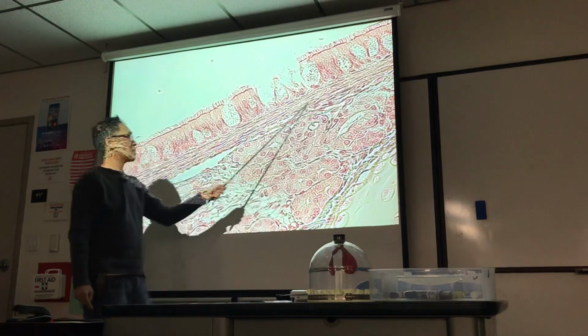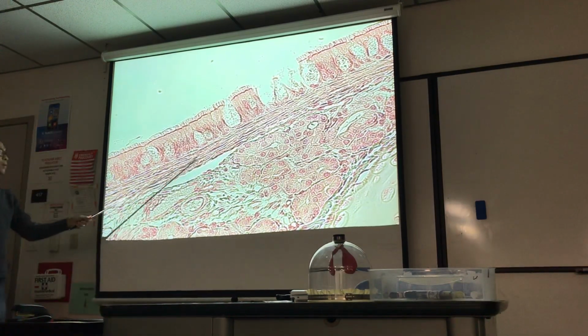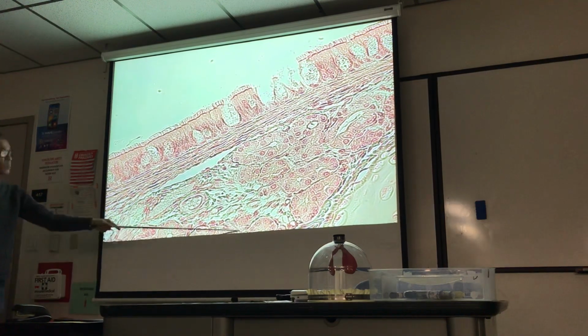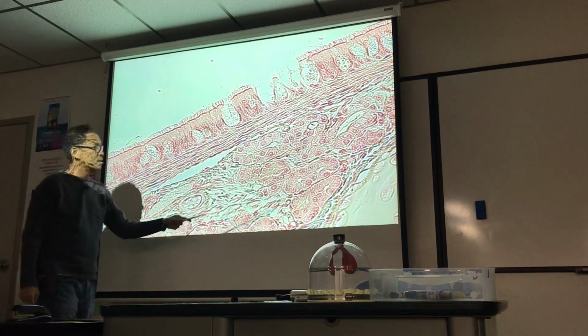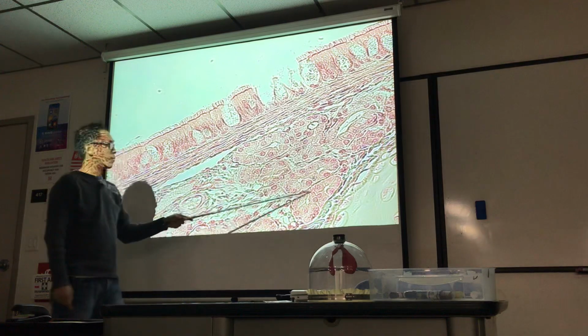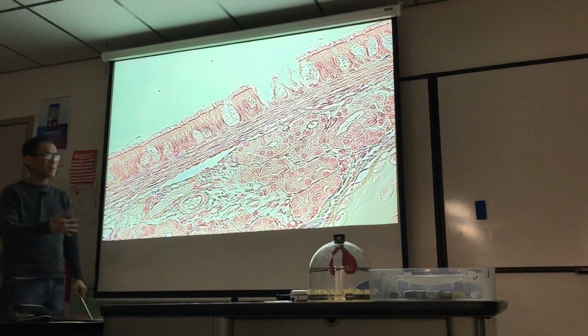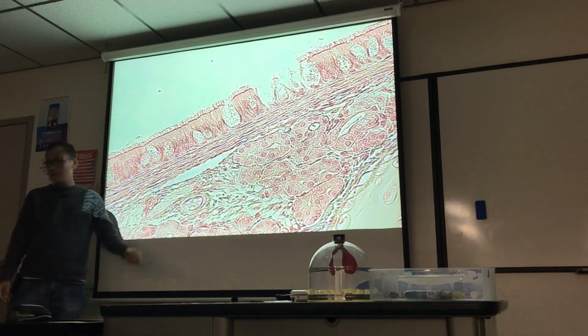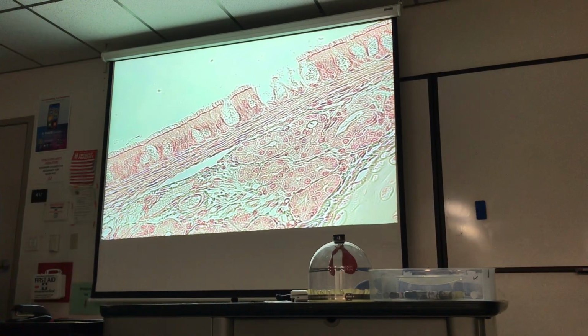What do we call this? The basement membrane? Lamina propria. We also see the submucosa. We see nicely arranged seromucous glands or just mucus glands. Some kind of mucus, some kind of gland. I'll put that in there as a choice. I usually want you to identify those as well.